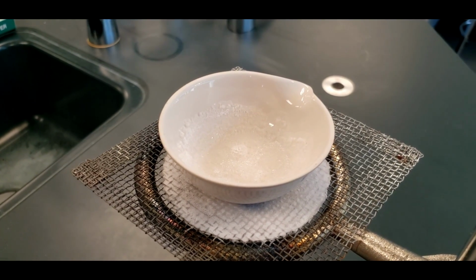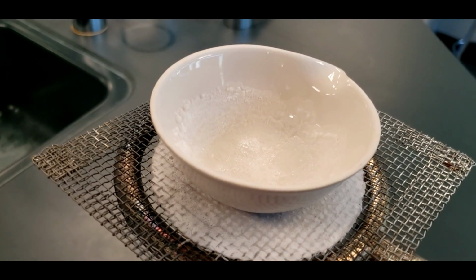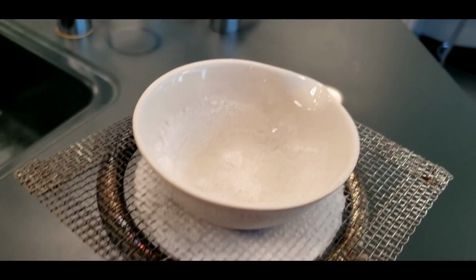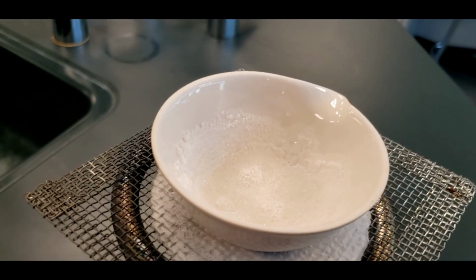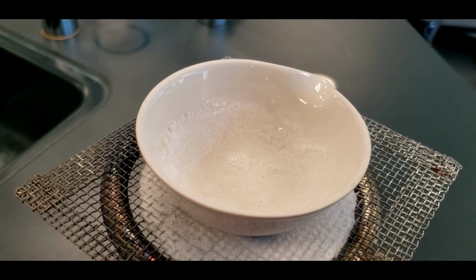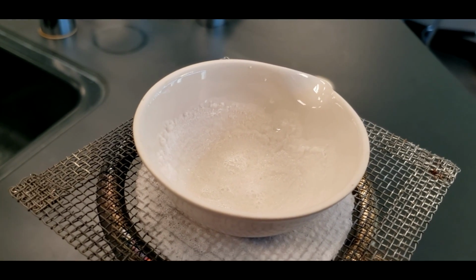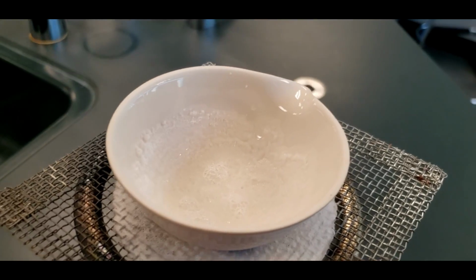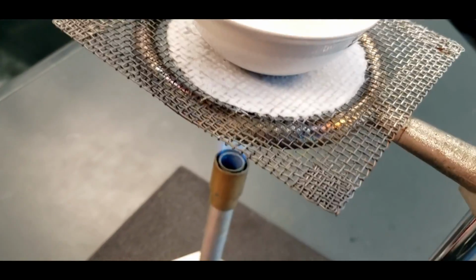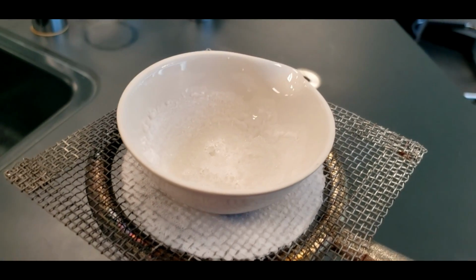I heated it up a couple of times, and then when I pulled away the last time, you can see that it's so hot it's just steaming away the last of the water. Don't really have anything that's sputtered out. You can see it's not really white. It looks like moist snow, right? It's a slushy. That means there's some water in there. So what we want to do is heat it up, and it should become very white when all the water's gone and it's just the salt.